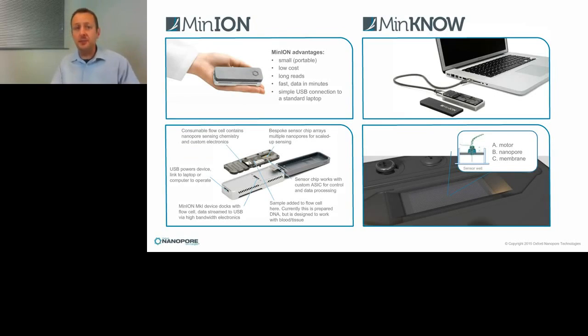Here's a look at the MinION. And as you can see, it's small, so it's portable, and this opens up the possibility of using it outside of a laboratory environment. We've already mentioned that it's capable of producing long reads. As far as we can tell, the only thing which limits the read length is the quality of the input DNA. One thing that I haven't covered so far is the real-time nature of the data generation.